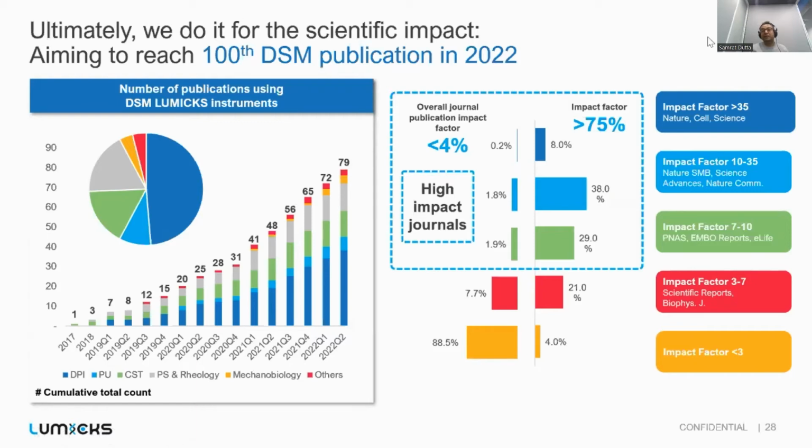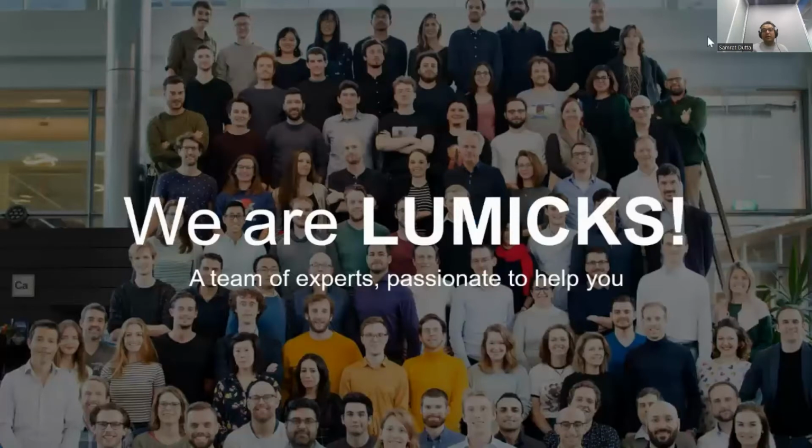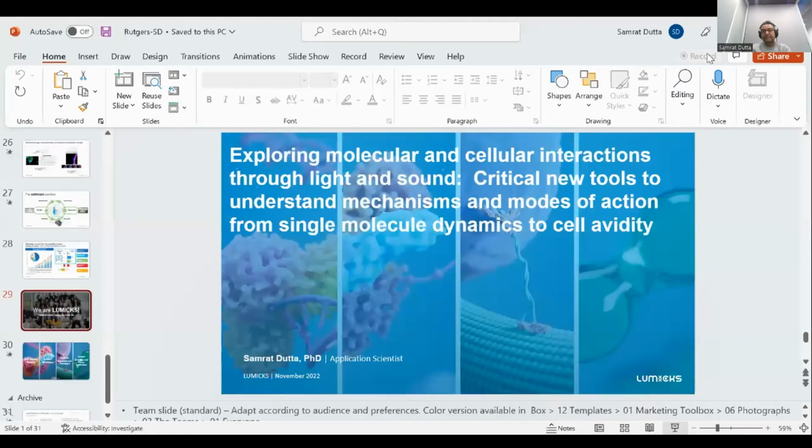We are more and more interested in knowing the mechanics related to a biological system or a biological function. With that, I will pass it to Jens, who is going to tell us more about the Cell Avidity instrument. Thank you very much.